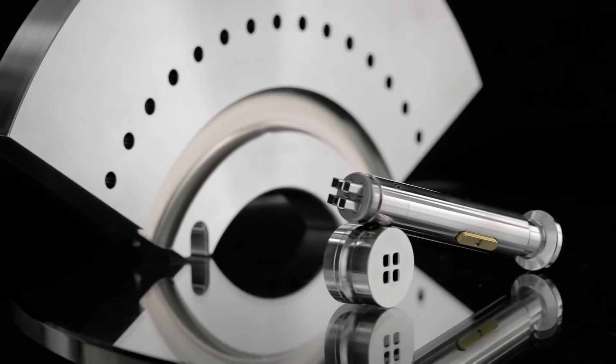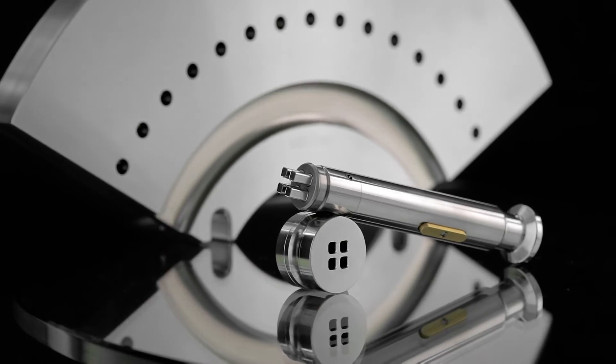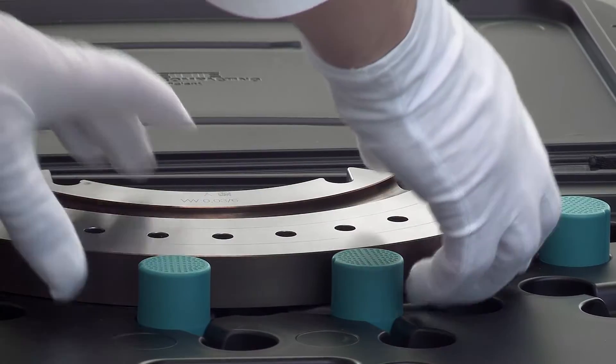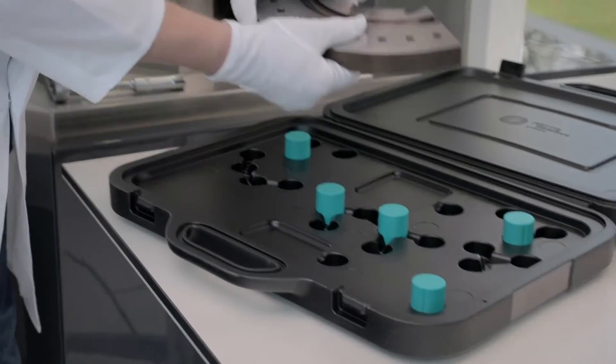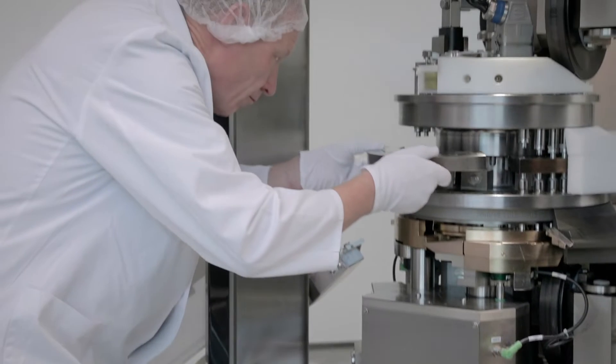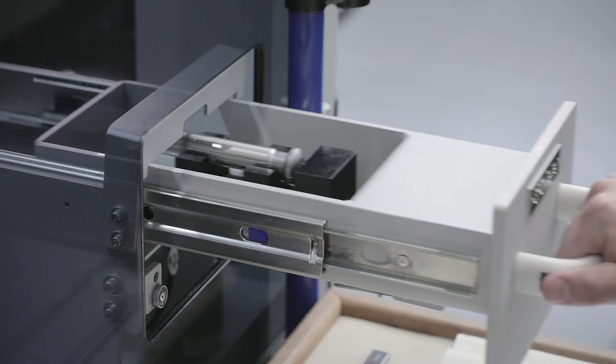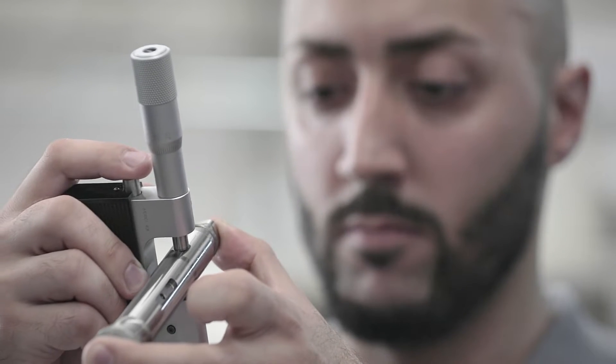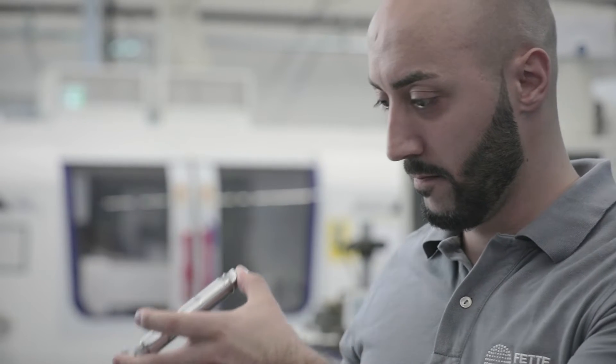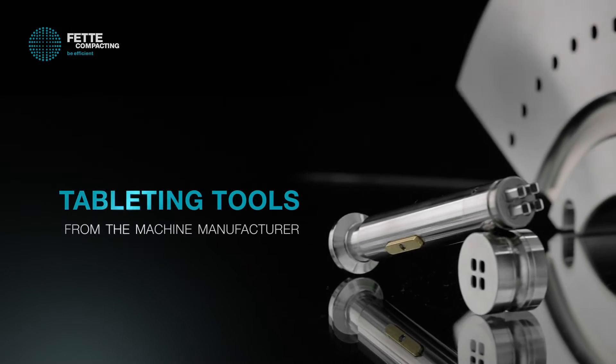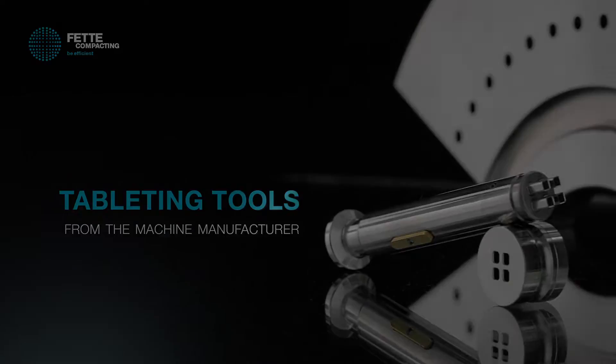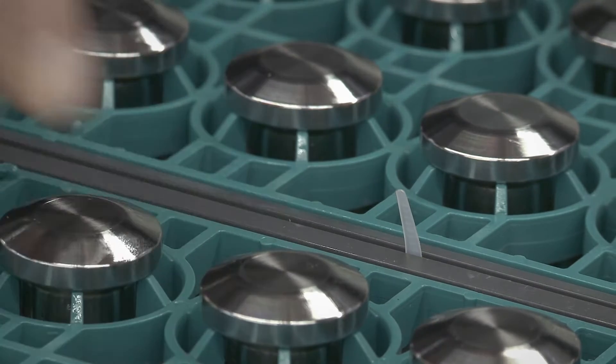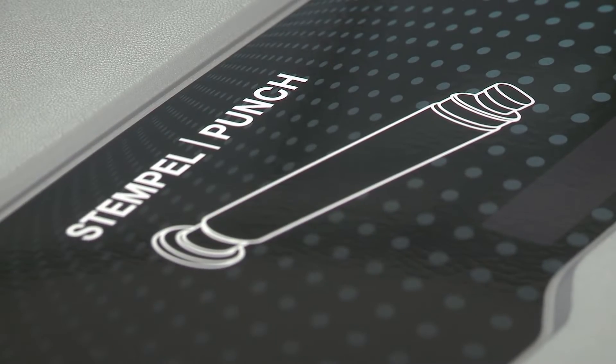Punches, dies, and segments - high-quality tableting tools are the key for efficient production processes. Fetter Compacting is the only supplier that has been producing both tablet presses and tableting tools for more than 70 years. My name is Christian, and at Fetter Compacting I'm responsible for the BU tableting tools.